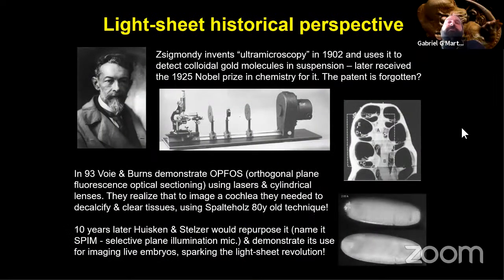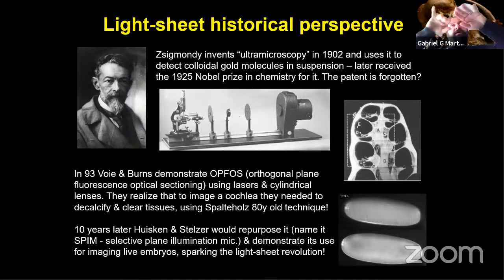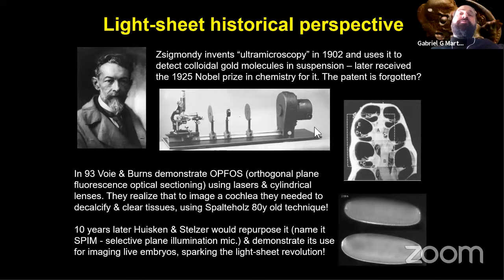So light sheet microscopy, just a very quick historical perspective, was invented early in the last century by Zsigmondy, who was actually a chemist, and he was interested in looking at colloidal gold particles in suspension. He got this idea of making the light focus just in a plane, and then as colloidal particles were going through that plane of light, he had an objective on the other end and could detect them like a blink. He was able to measure lots of properties of colloidal gold in suspension this way. And for those discoveries, he was awarded a Nobel Prize.